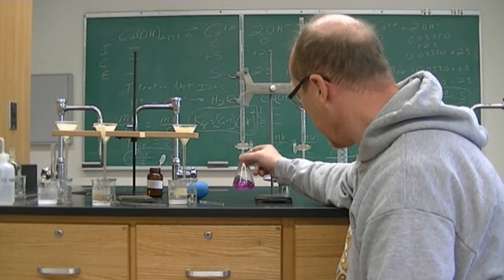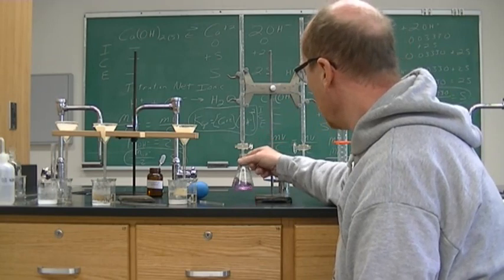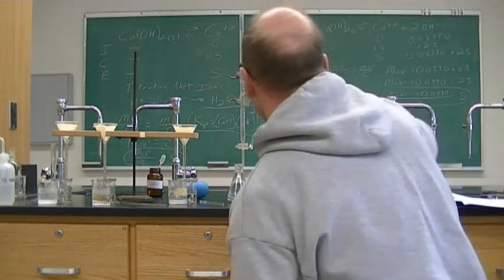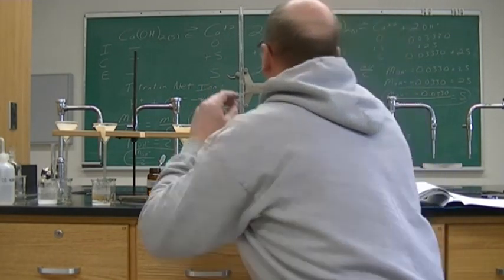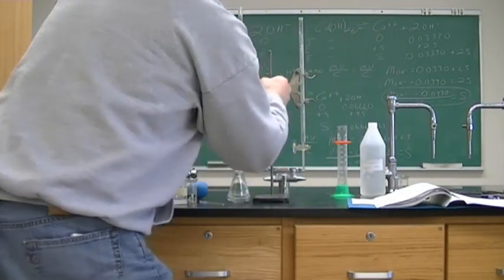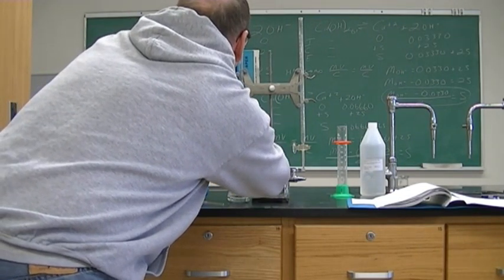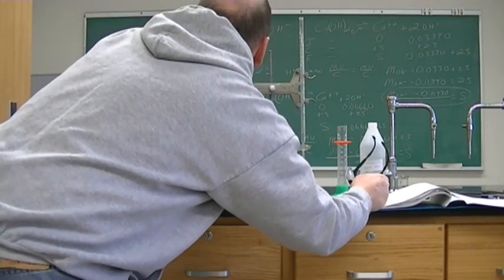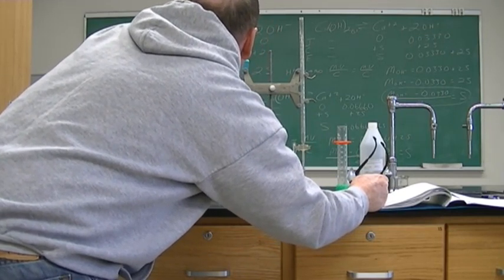Getting lighter. All right, so here's our light pink, and then one drop turned it to colorless. All right, so our final volume is 10.68.